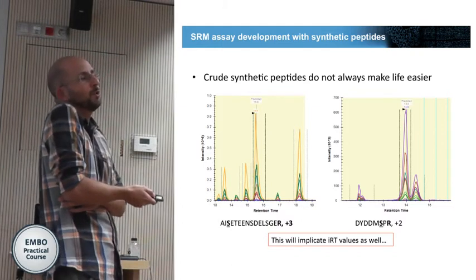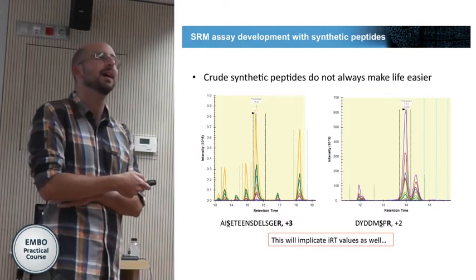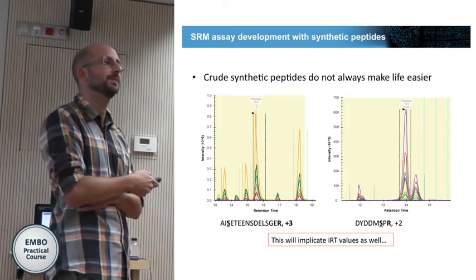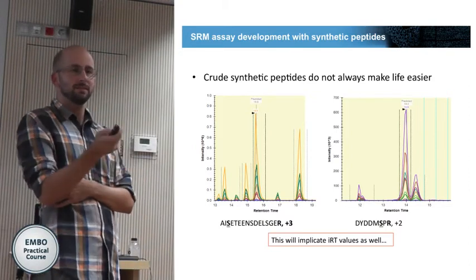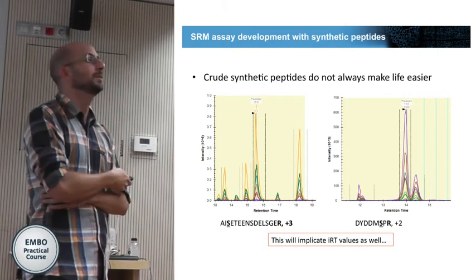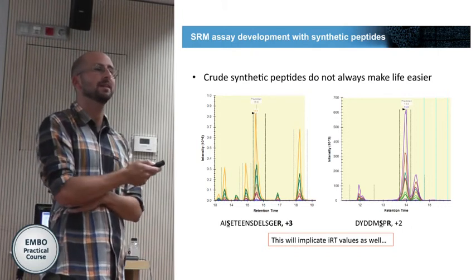I again would like to hope that they don't randomly shuffle sequences. If they're a different length, they would have a different mass, they wouldn't pass the Q1 filter. Think of miscleavage, it would not pass the mass filter. Sorry? Degradation would not pass the mass filter unless it's an in-source degradation.